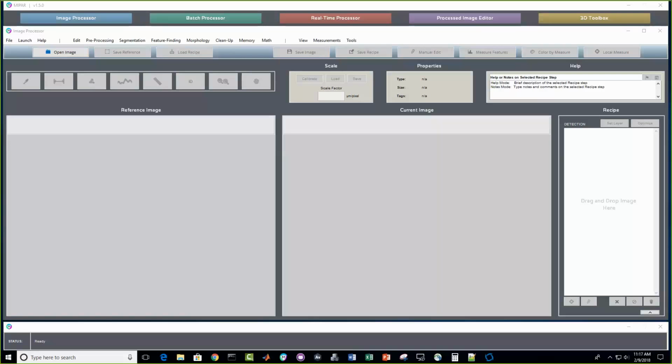Brian, thank you very much for joining us. We'll do our best to work in your feedback that you're willing to share during the rest of the webinar, and I'm sure we'll have that opportunity. So to begin, I wanted to start with a very simple second phase example. We call them simple particles, and we'll open them up here in MIPAR and get started.